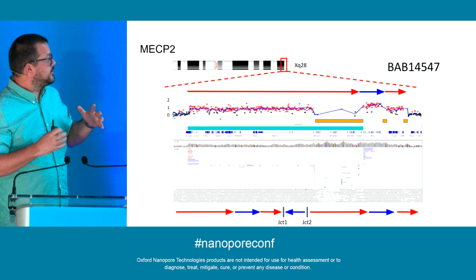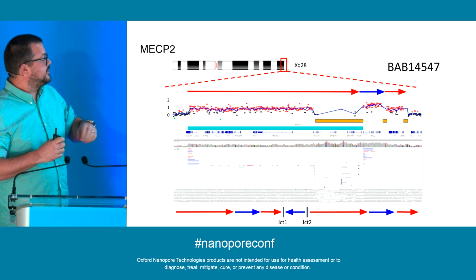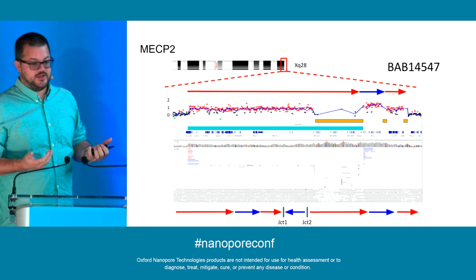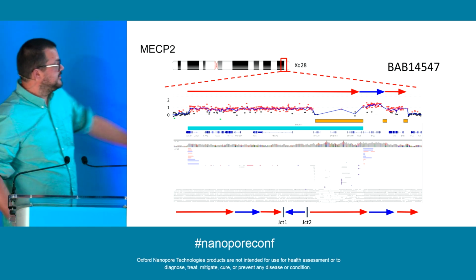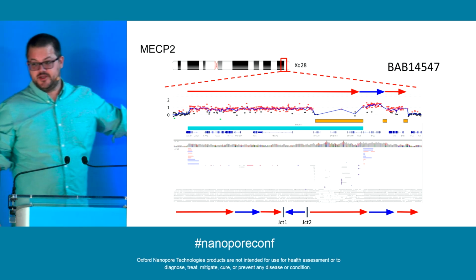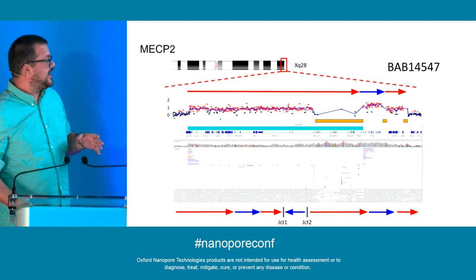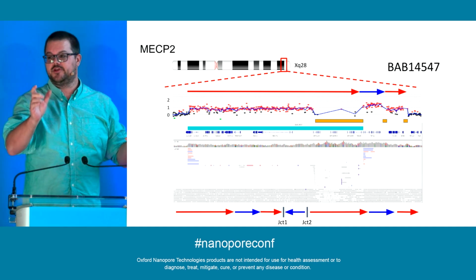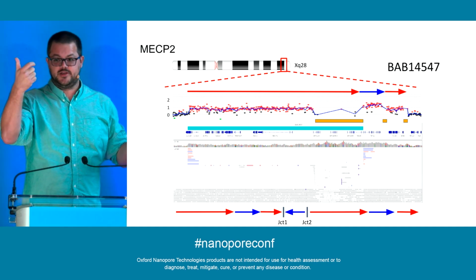What is actually going on, indicated by the red and blue arrows, is you have different segments of this copy number. In the segmental duplications in orange, you don't see any data from the array, of course. And the actual allele is displayed on the bottom of the page in that proband. What we have is basically a duplication event, and inside of the duplication event, we have a triplication that is also inverted simultaneously.